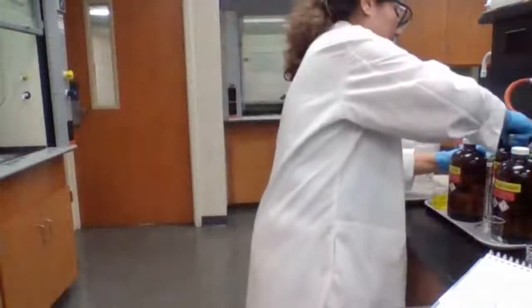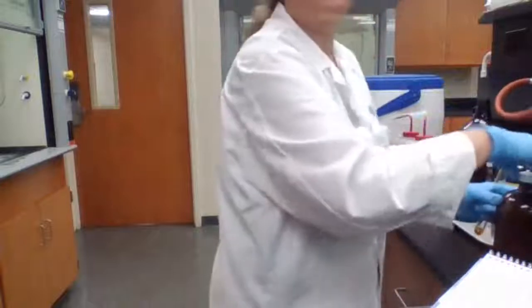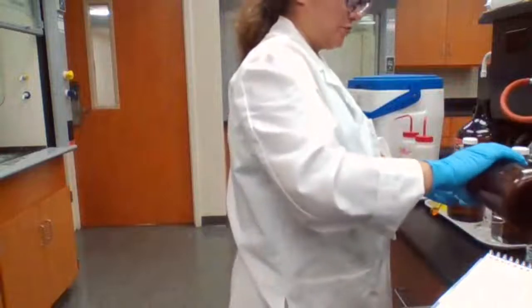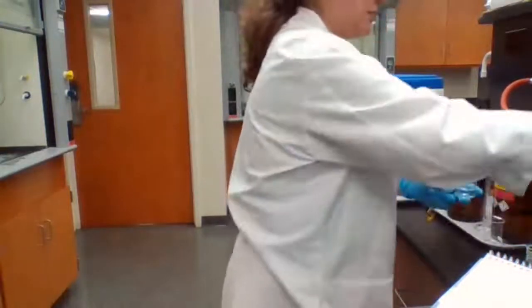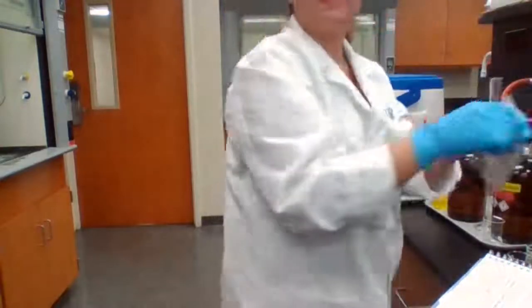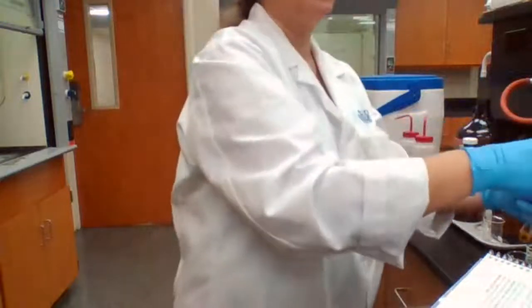Then I want to add, let me find a dropper, sodium hydroxide. So 1 molar sodium hydroxide. You're adding sodium hydroxide to the solution.